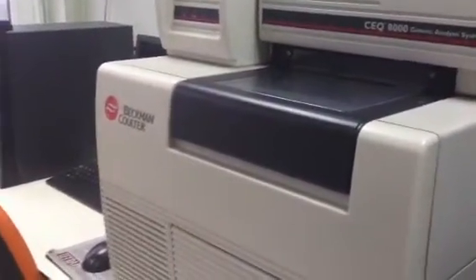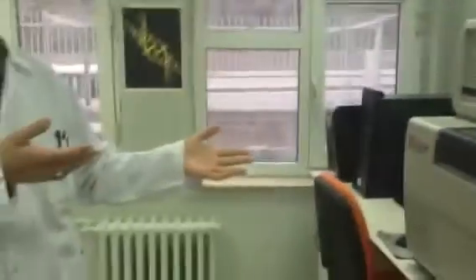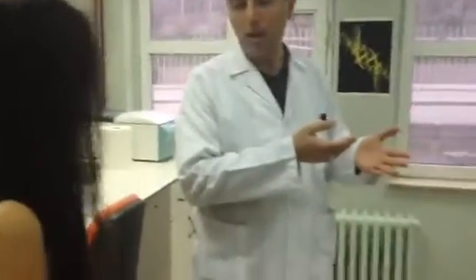After 1 or 2 hours we determine results for viruses or bacteria, AT, AT, GC, and I save the file as a Word document. For example, I work 30 samples, and when the sequence analysis is finished, I give the results in a Word file, and I give them to the computer for bioinformatic analysis, then the dendrogram.